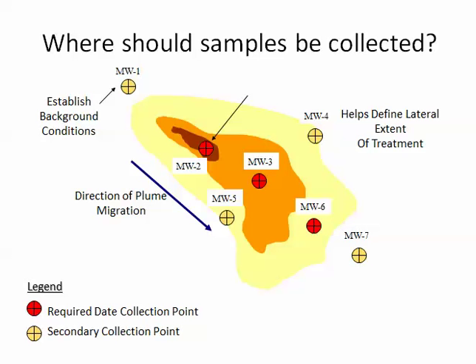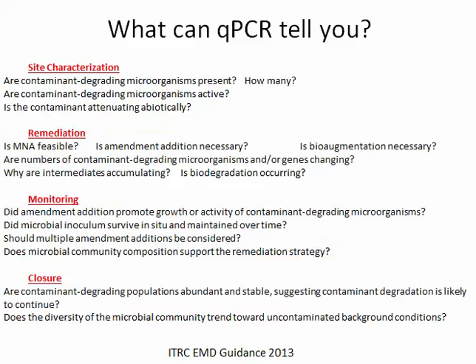So as far as taking samples, as a lab, we'd like you to take samples everywhere all the time. But obviously, where you take samples depends on the site objectives and goals of the particular project. But usually you don't need to analyze every well. A good rule of thumb is to sample where things change. Now that change could be geochemical, contaminant levels, or something else.